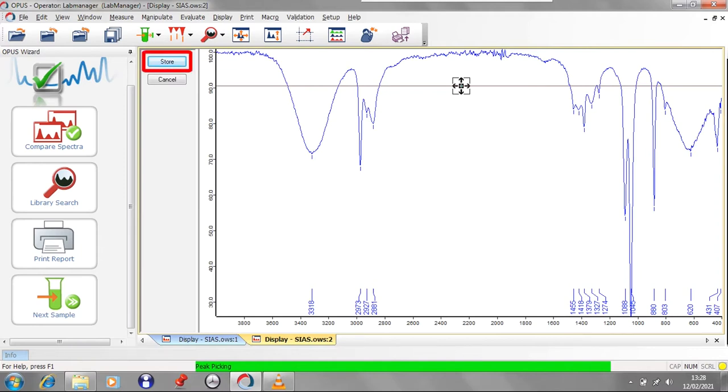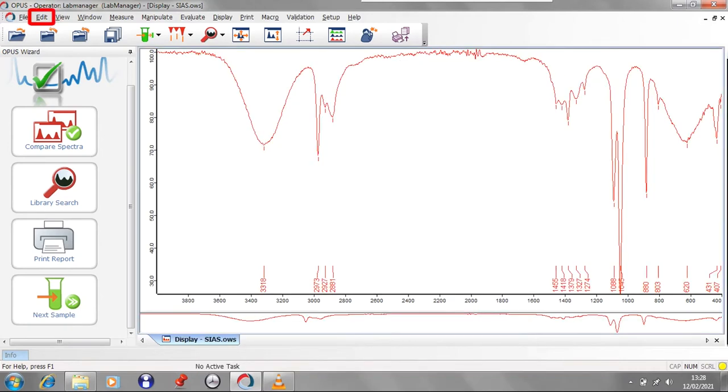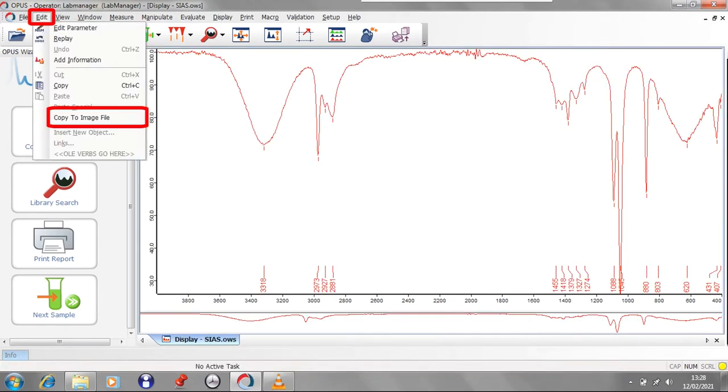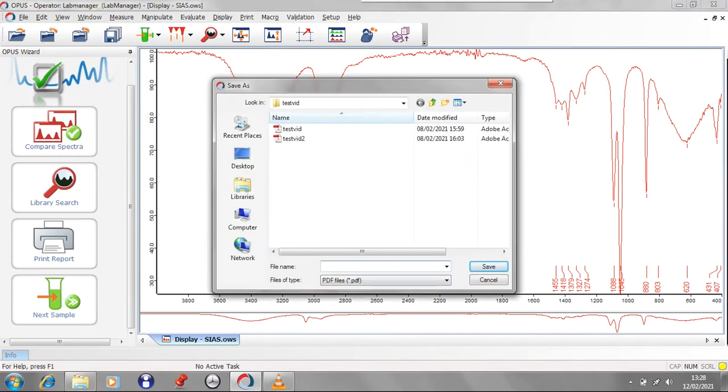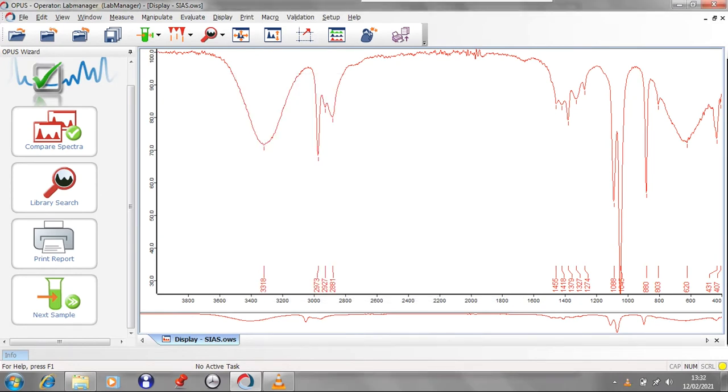When doing interactive peak picking, in order to keep the chosen peaks, press Store, which takes you back to your spectrum with the peaks you have chosen. You can save the spectrum as shown here to a PDF file for later analysis. These files can be transferred to a USB stick if you wish to view them later.